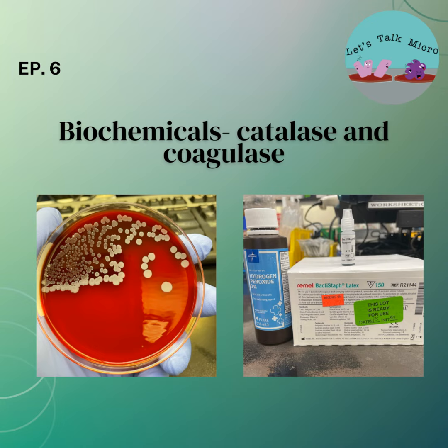And some of you students, some of you microbiologists out there already know where I'm going with this. Why should you see it immediately? Well, the reason is because Enterococcus, which is not a part of the staph, can have what is called a weak positive reaction. After the colony comes in contact with the catalase, after maybe 2 seconds or so, you can see some bubbles. And this is not considered a positive reaction. So you should see it very strong. Those of you that perform a catalase should see it. When you have a staph, you add that colony and right away you see those strong bubbles.